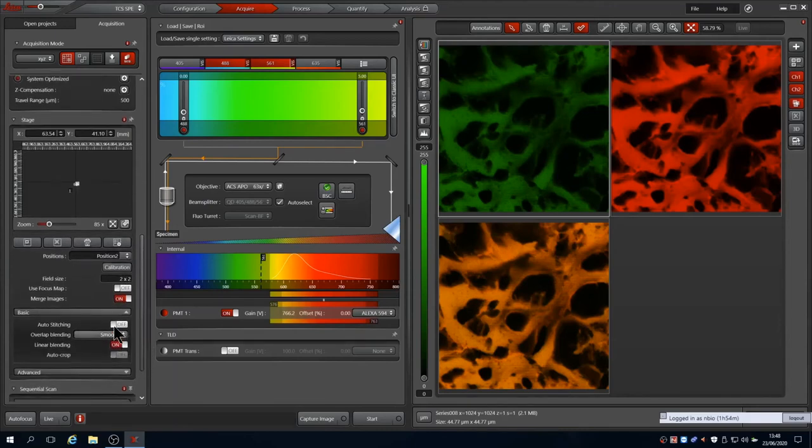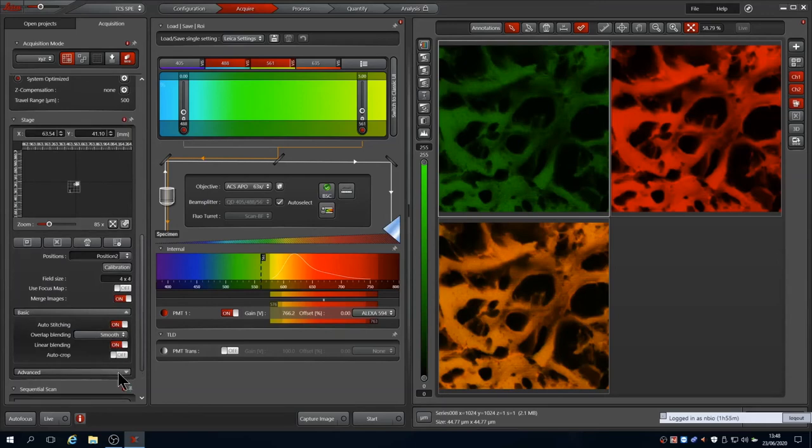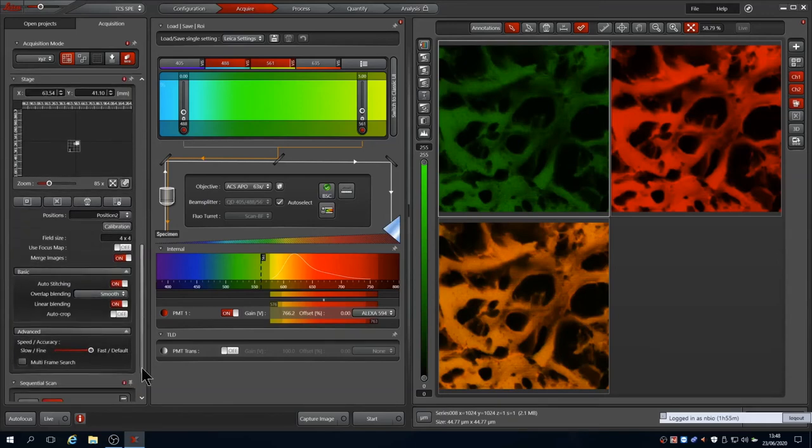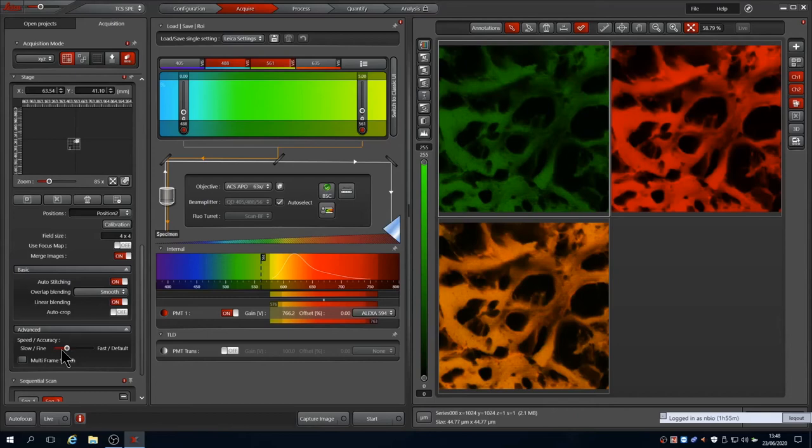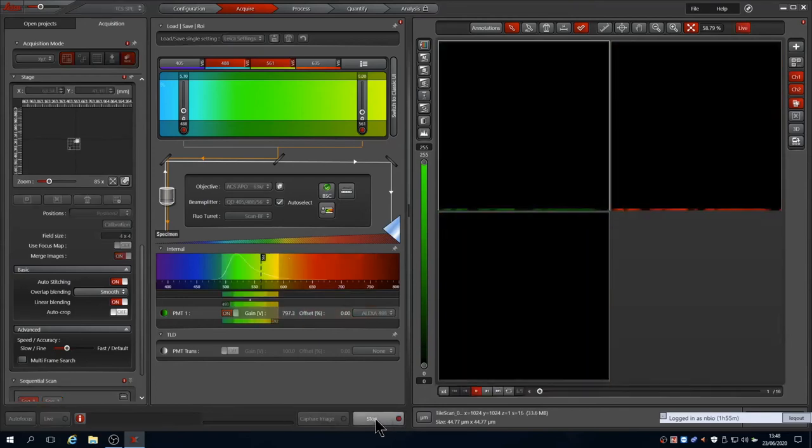For example, we can get the Tile Scan to cover the whole area between the marked positions. We do this by switching auto-stitching on. We can also automatically merge the images, and if so, control how to overlap and how accurately. LAS-X performs best if the speed is reduced to about ⅓ of the range in the advanced options.